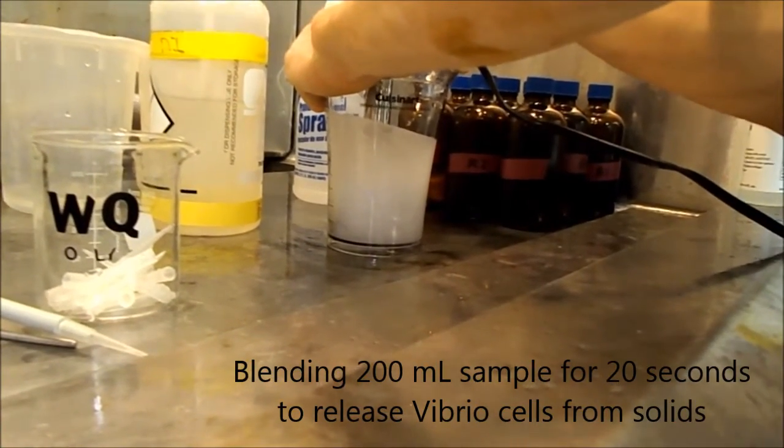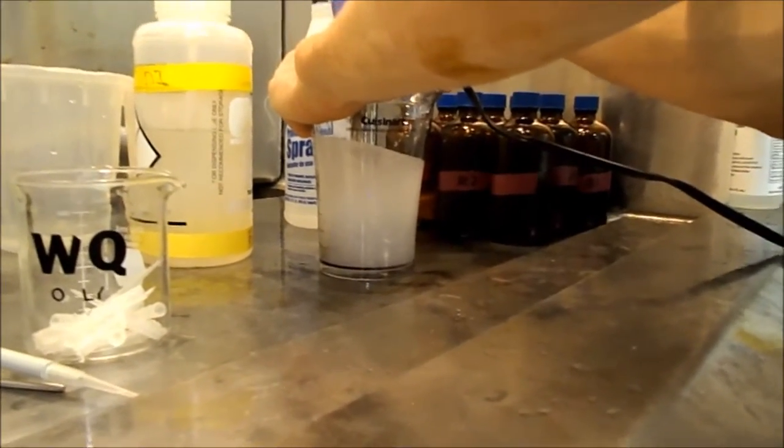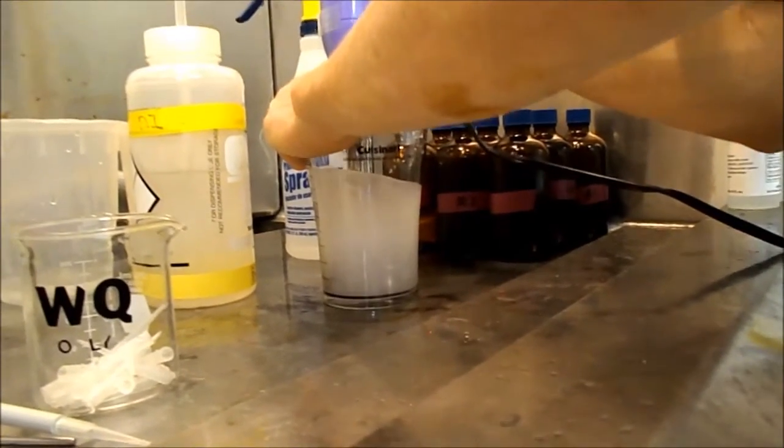Time it, how long are you? About 20 seconds. 20 seconds. And of course, if we have more biofilm, we may need to keep it longer. At this stage, it probably doesn't matter.